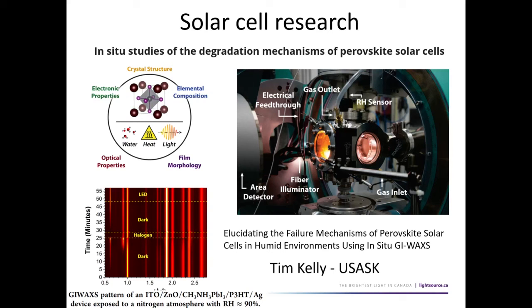So he has electrodes connected in his environment too. So he brings this chamber to the beamline, and he's able to see the diffraction peaks of his material while he has, well, light on and off. This is a simulated sunlight where he controls the humidity and the temperature.